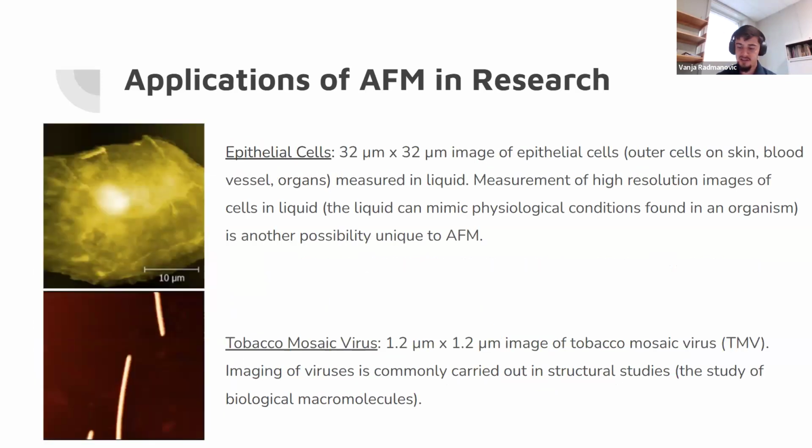And then here's an interesting one, epithelial cells. This is an image of one of the outer cells on skin, on blood vessels and organs. And what's interesting about this is it's measured in liquid. So AFM has the ability to do high resolution images of cells in liquid, and you can get the liquid to kind of mimic realistic physiological conditions that are found in organisms, which is another possibility unique to AFM.